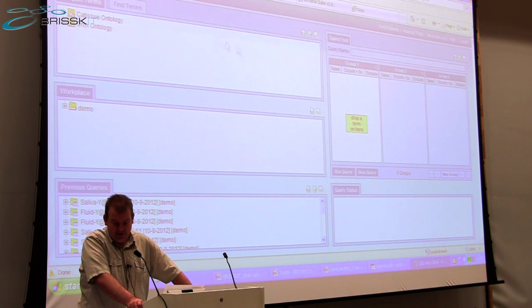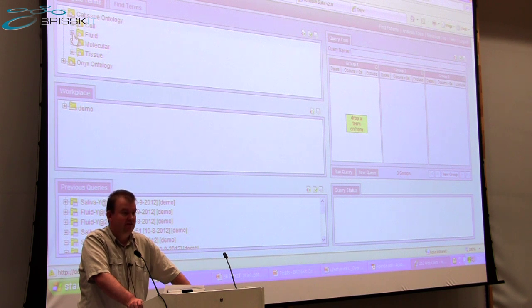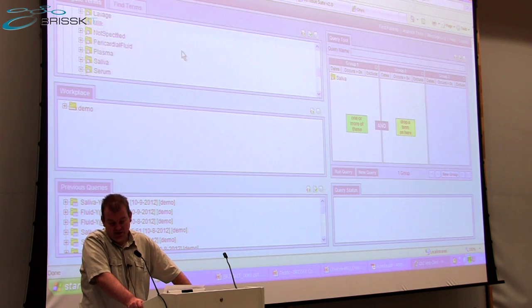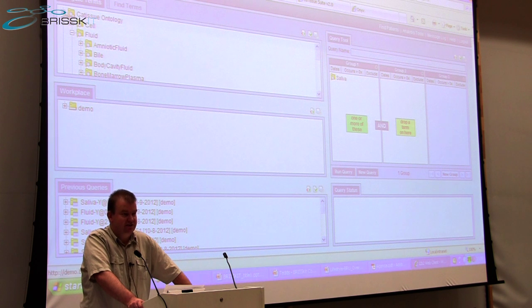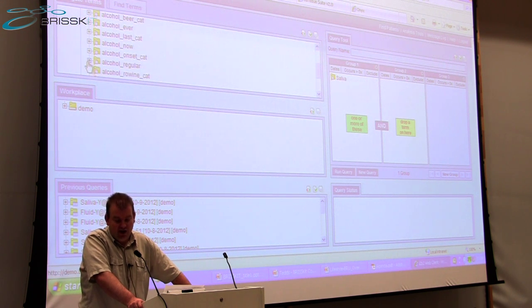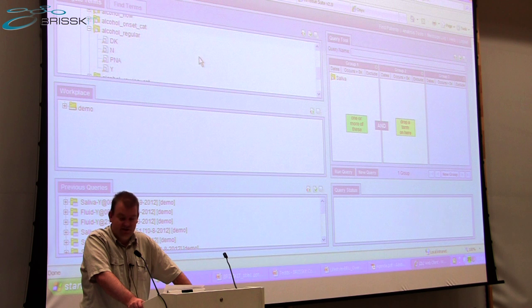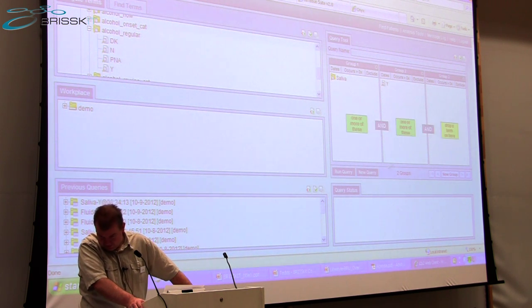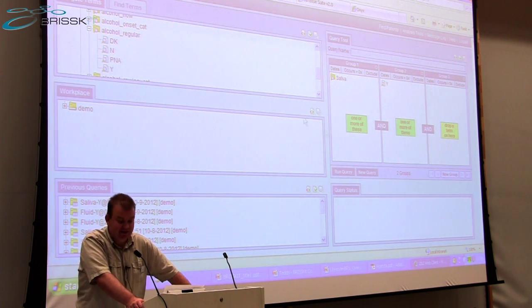And what Olly's now going to do within I2B2 is define the search criteria for a particular research cohort, combining some data from a CA tissue derived ontology around the existence of saliva samples in our repository, coupled with, from the risk factor questionnaire, a question about alcohol use. So maybe the researcher's interested in analysing the saliva of regular beer drinkers, was it? I didn't say. Oh, any alcohol.